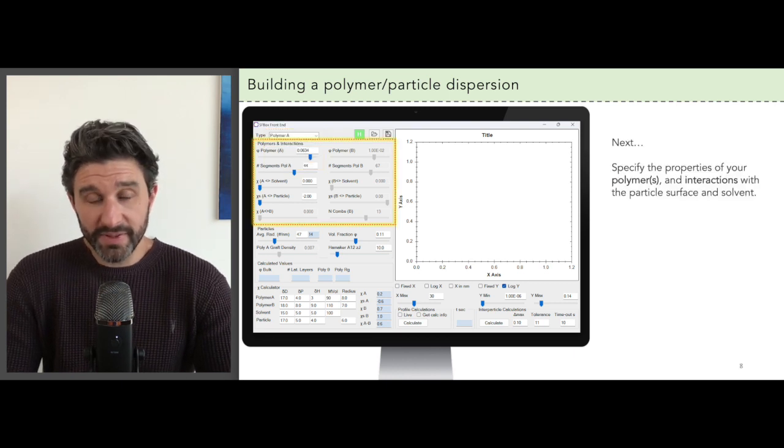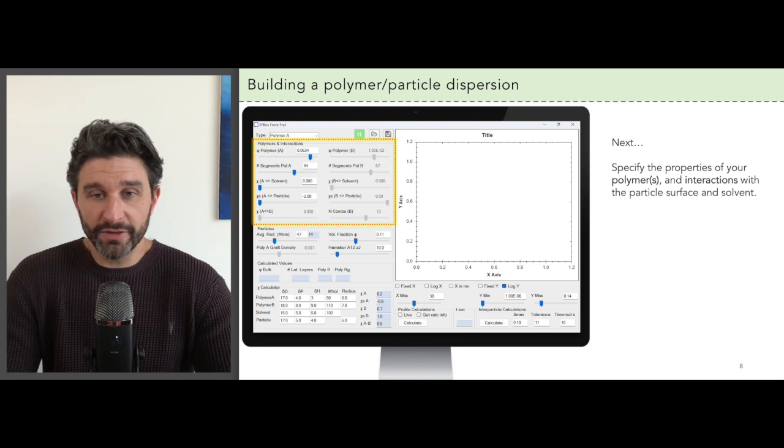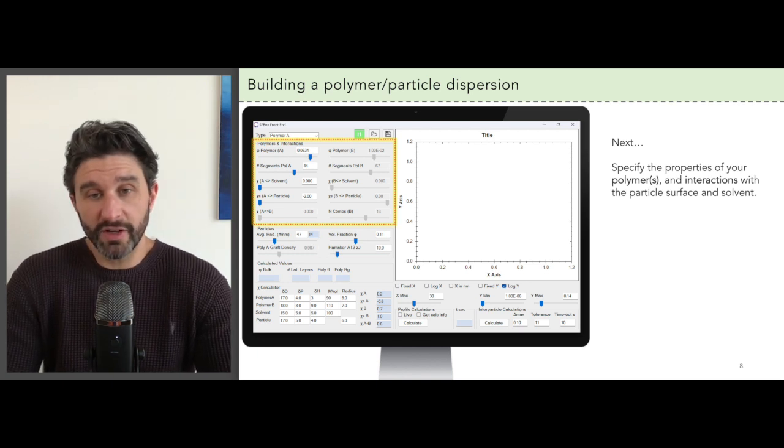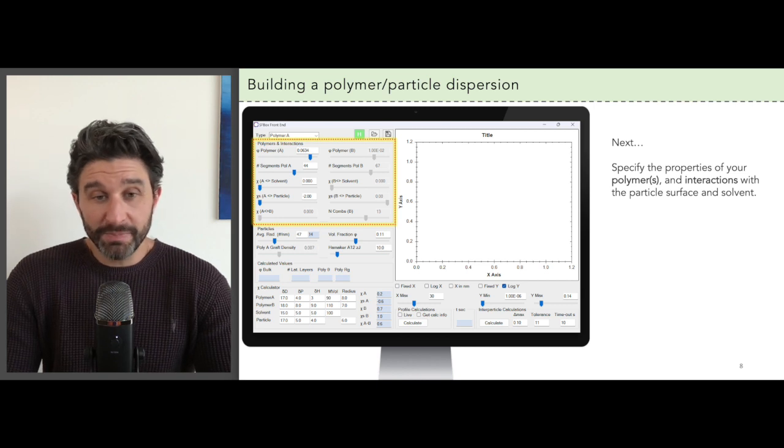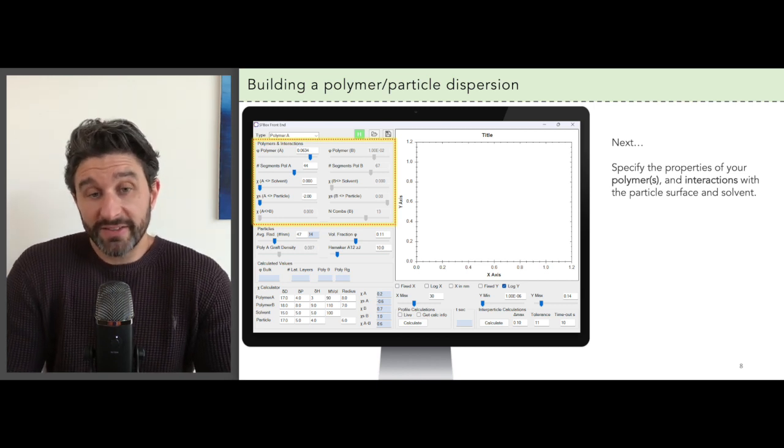The next step is to specify the properties of your polymers and also the interactions between the polymers and the solvent as well as the surface of the particles. Let's use the polymer A or homopolymer as a simple example here.